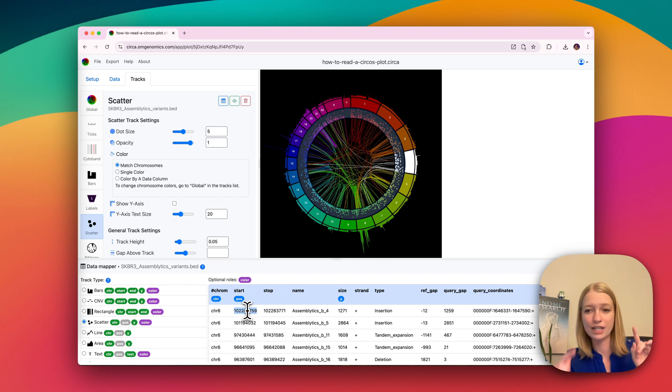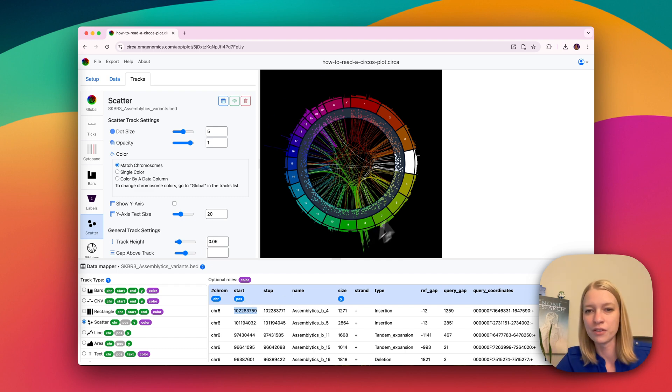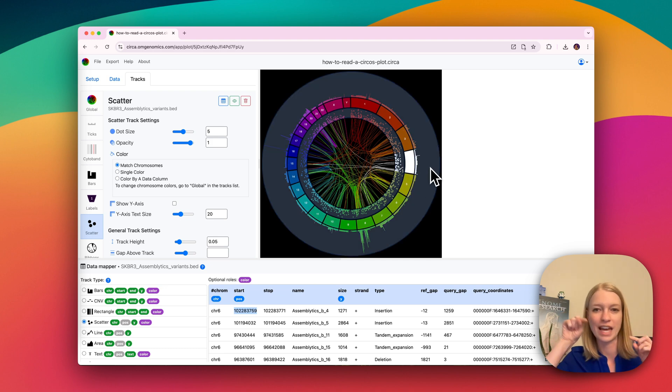So when it's just a point, you have one chromosome and one position, and that just tells the algorithms for plotting where that data point is located.